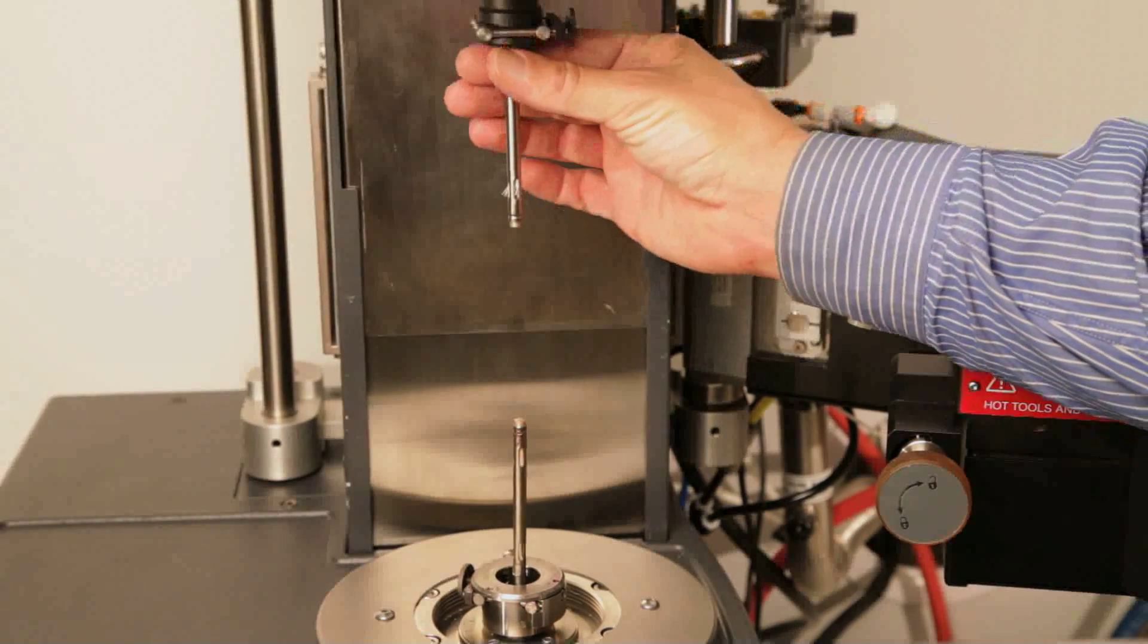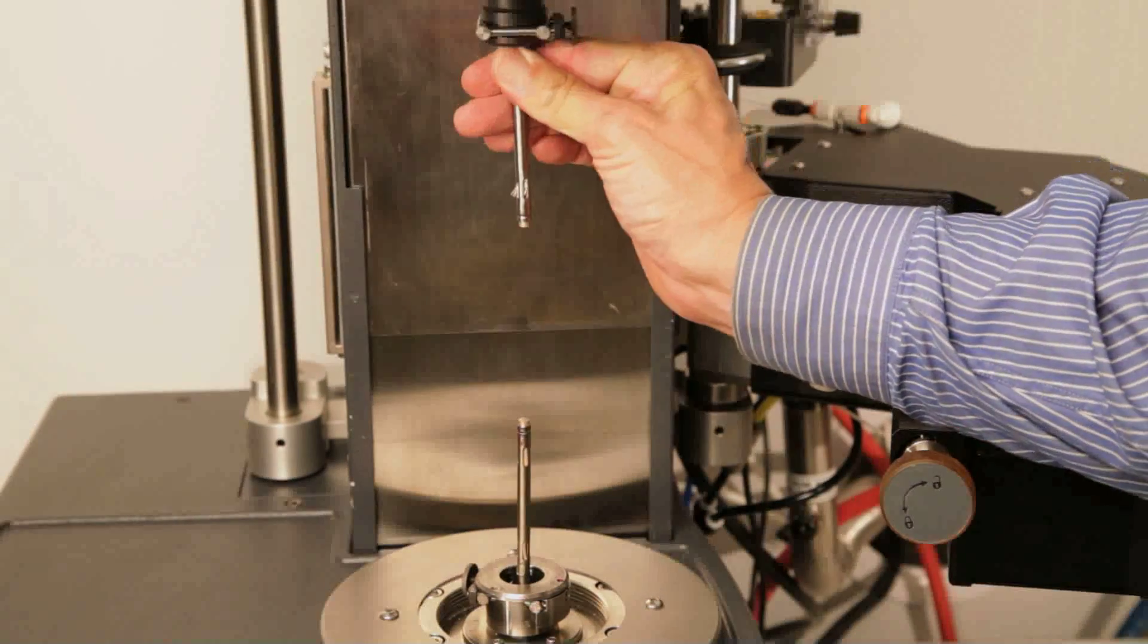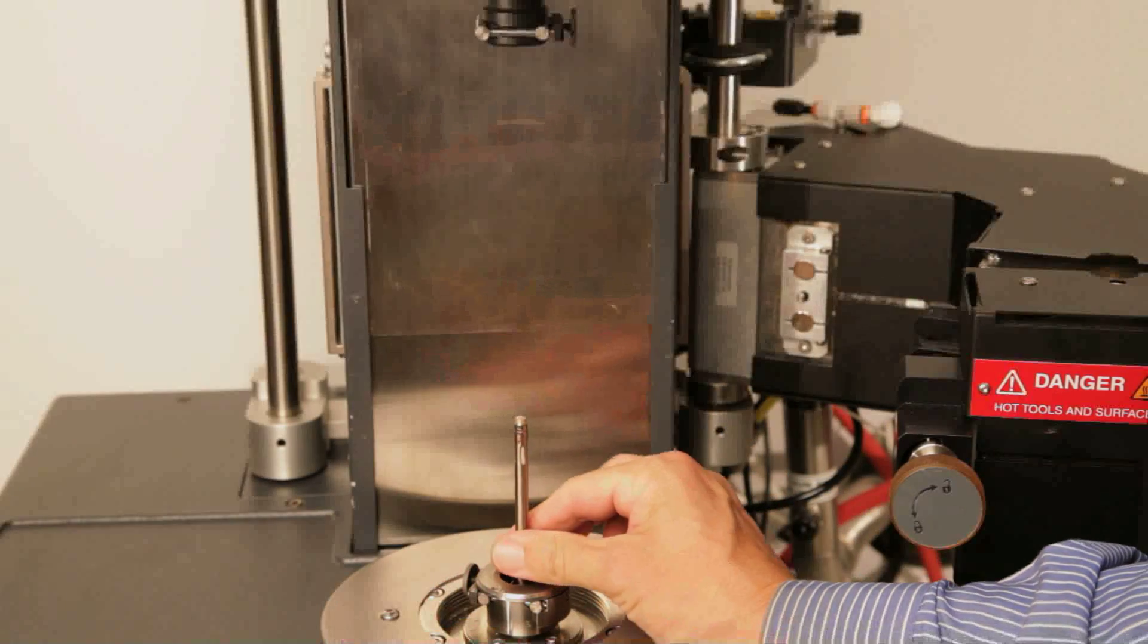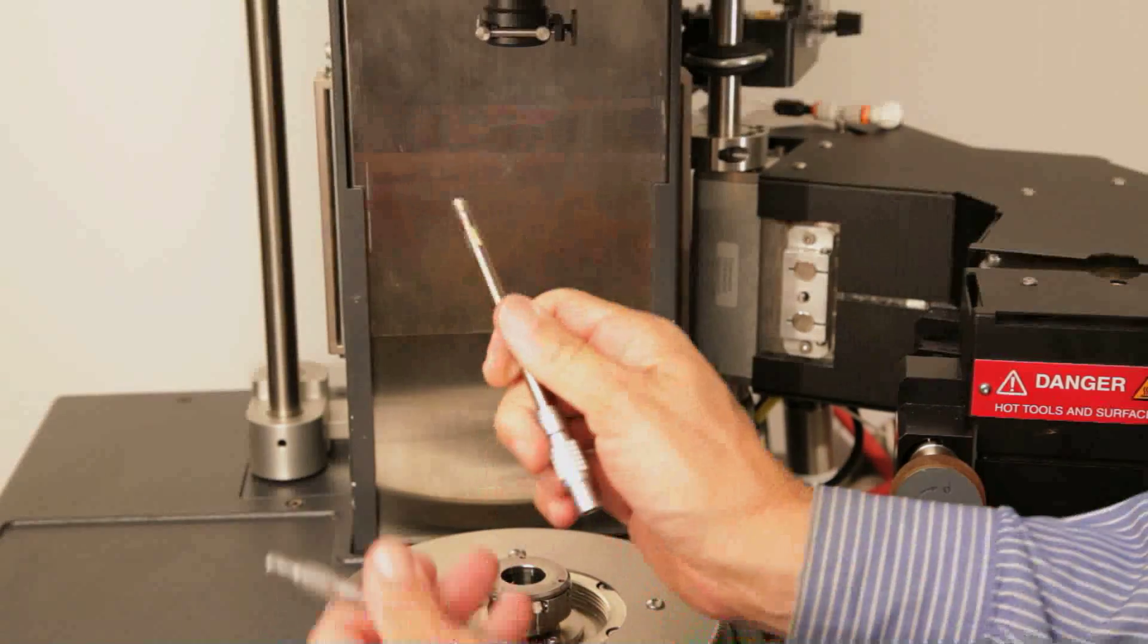If the ARIES G2 has been previously configured with upper and lower PRTs, remove them before attempting to install the torsion fixture.